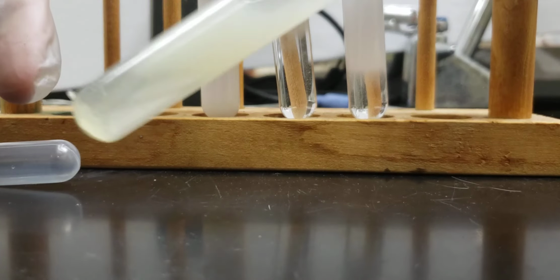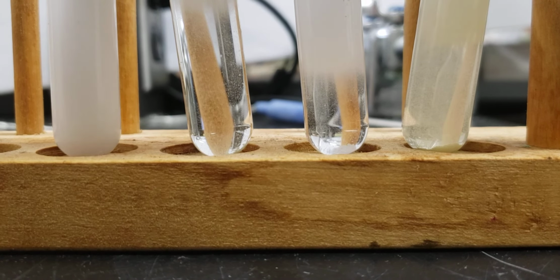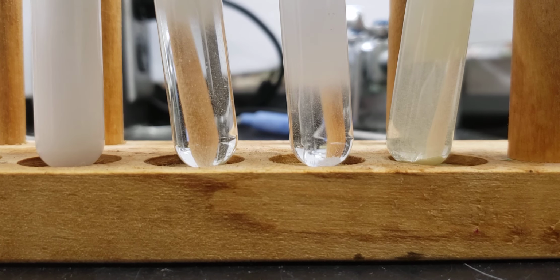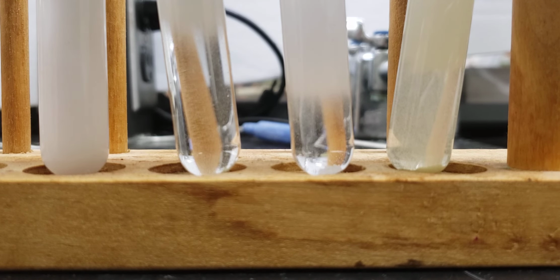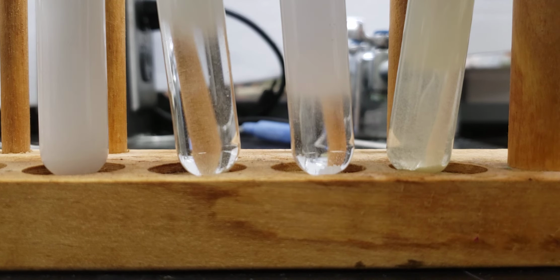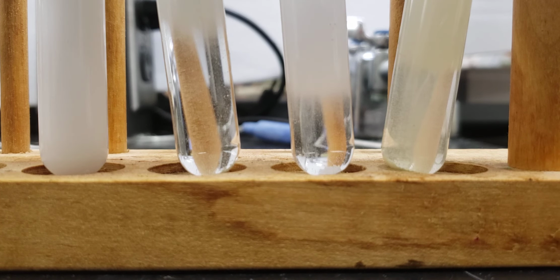Okay. You can see for two of the test tubes that it's relatively clear at the bottom, which means that we're not getting any precipitating down forwards. Whereas the one that's all the way to the right here, it is very, very murky there because of how much of it is precipitating out. And we can say without a doubt now that because iodine is not affected, that this test tube that's in test tube X is likely to be iodine.